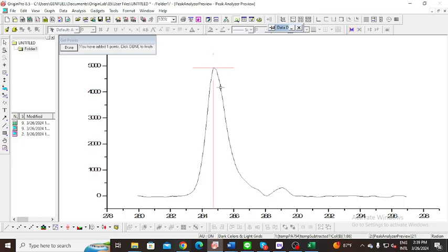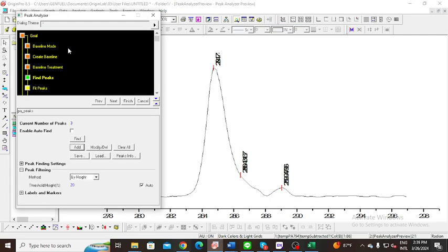It also needs a double click, because if just one click, it will just place the marker. And as I mentioned before, this one is also supposed to have peaks, and we can also see a little bit of shoulder here. So just randomly pick around here. And the third one is here. So it's already done, and done. And this one no need to change, just next.